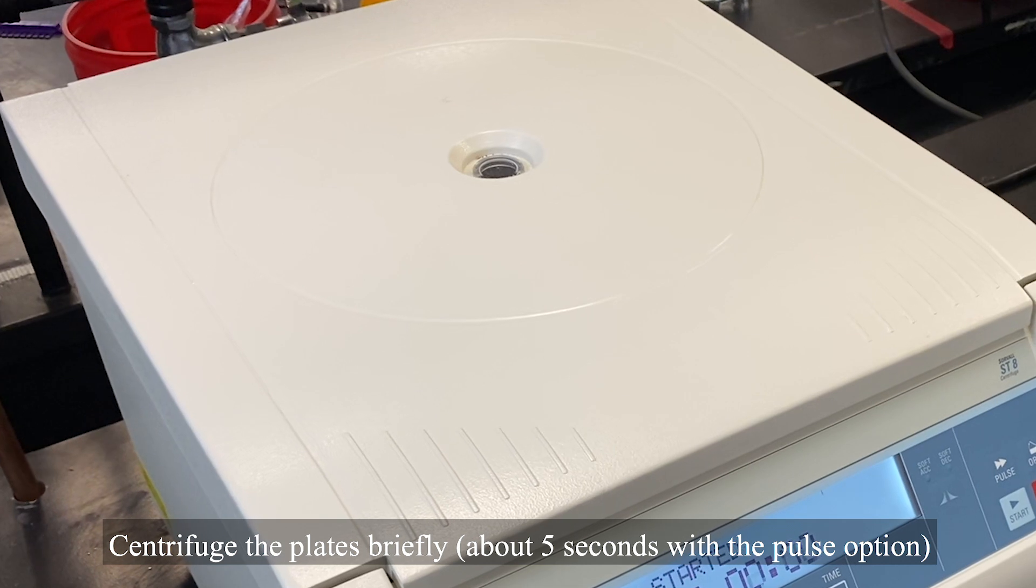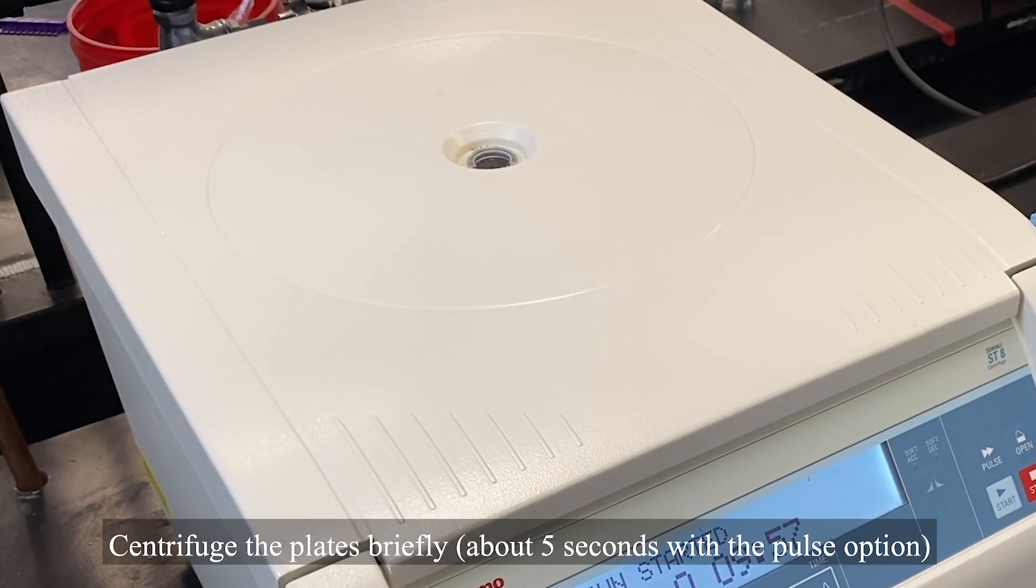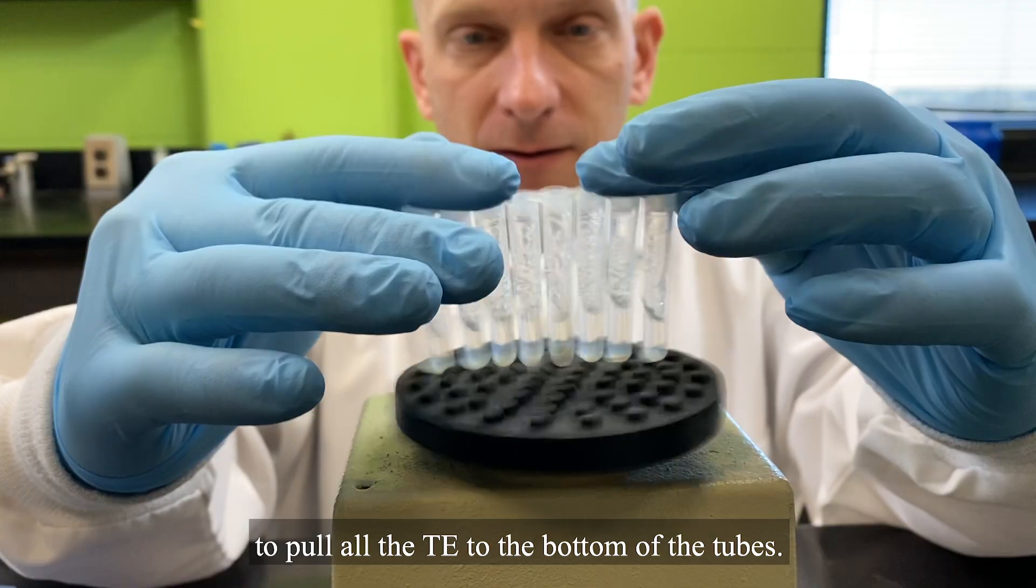Centrifuge the plates briefly, about 5 seconds with the pulse option, to pull all the TE to the bottom of the tubes.